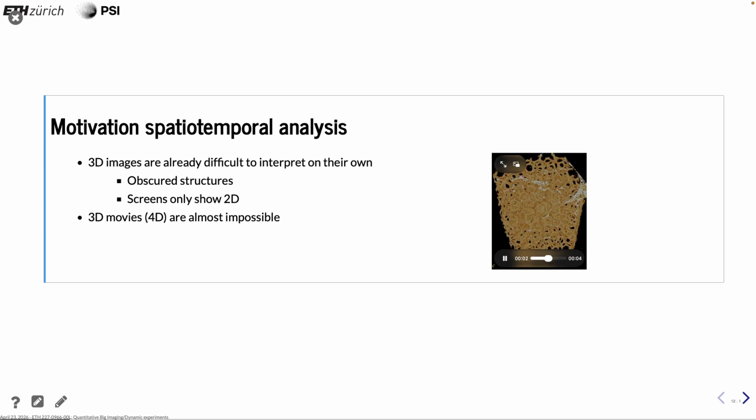You can, of course, look at this movie, see that things are growing a little bit, but you can't really tell much from it. So detailed things over the volume, like as I said before, if you have bubbles that are moving fast along the walls or in the middle, it's a bit difficult to see it here. So you really need to do an image analysis approach to tell anything.